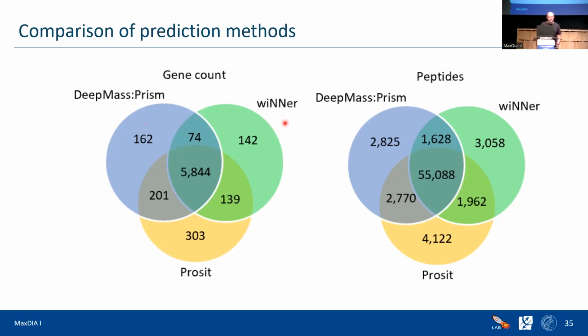And also, usually you don't need that big training data. So deep learning is very precise and accurate, but the deep learning paradigm is always asking for infinite data, essentially, right? So it's like coming out of the Google search engine world, where the amount of data is no problem, but it's all a little bit noisy, unstructured, and you have to find patterns in these super huge data sets, which is an advantage because you don't have to think about it.